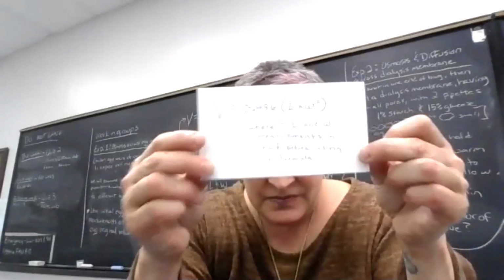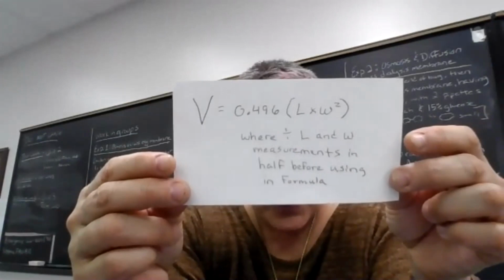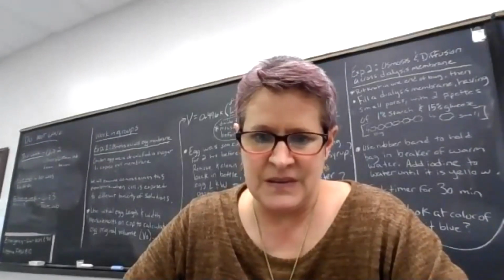But basically it's there. Okay, now it's all backwards. I'm looking at it right now, it's backwards. But basically, let me share the screen and I'll show you the formula. Okay, go back to our handout.